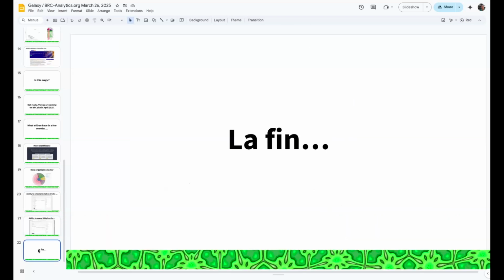And I think I have 3 minutes left, so maybe it's a good time for any questions. Okay, I'll start with this one. Indrish asked if there are Python Jupyter notebooks predefined for an analysis, so that users can just run it and customize it easily, or is it just a generic Python notebook that the user would have to figure out what to do with?